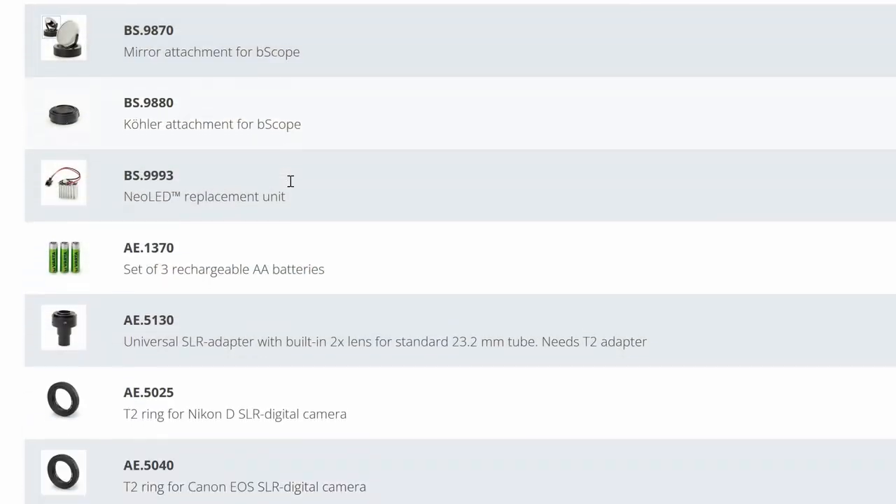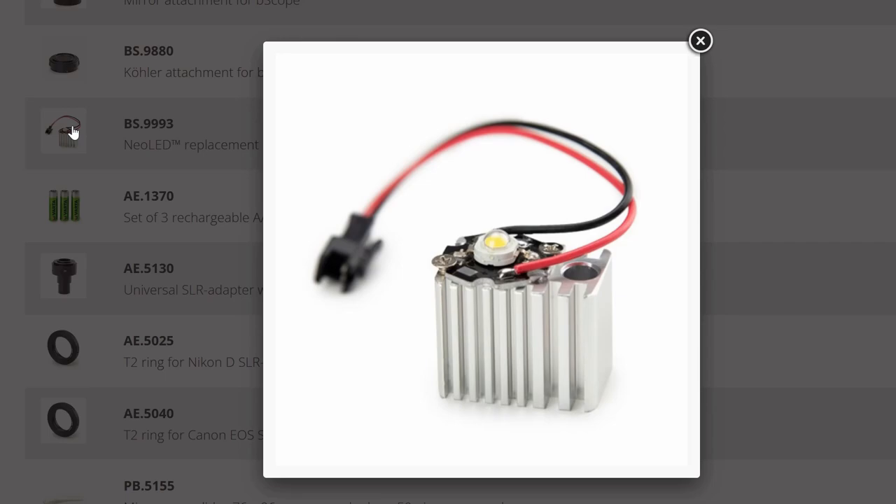The microscope comes with a 3-watt LED, and the LED is exchangeable. You are able to buy spare parts as well — the Euromax website offers a large list of different spare parts. Also interesting is that the microscope can be operated with batteries: it accepts three AA batteries, making you independent of a power source. This is especially useful in an educational setting where you have to transport the microscope and a power supply is not always available. However, it is quite significantly too large to be used as a field microscope, so the batteries are more useful in a laboratory setting without immediate access to a power supply.